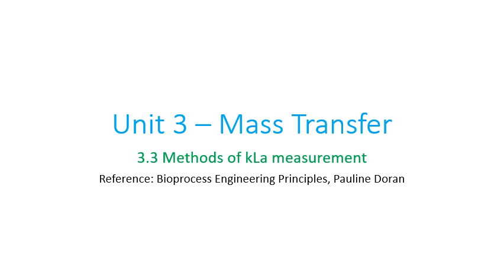Hello. In this video, we're going to see a few other concepts of mass transfer. Let's see a few methods on how to measure KLa in a fermenter. We've already seen the importance of KLa in the previous video, as well as what KLa is.